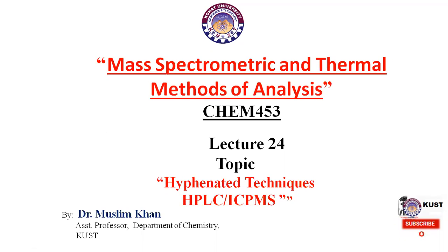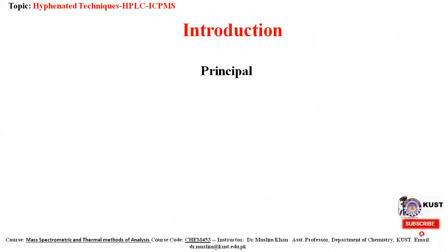Dear student, today the topic of our discussion is HPLC-ICPMS, one of the hyphenated techniques in mass spectrometric and thermal methods of analysis, having course code CHEM453. First of all, HPLC connected to ICPMS.